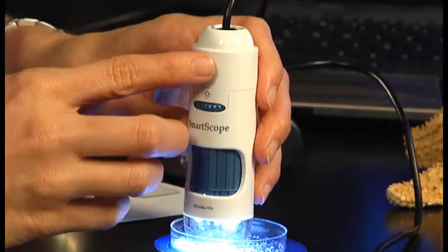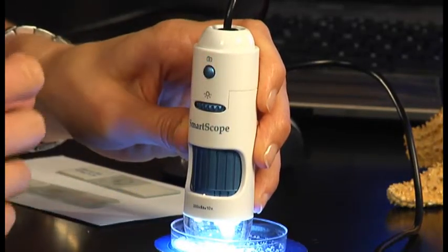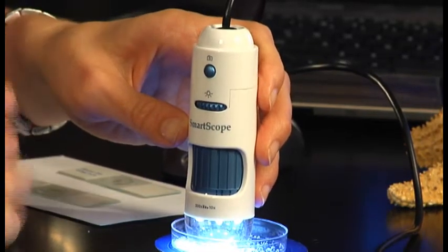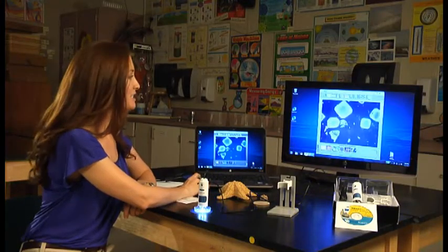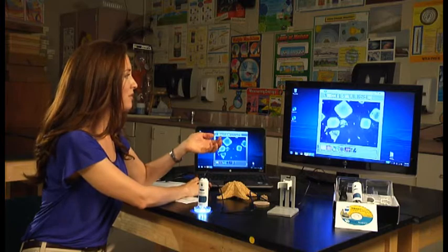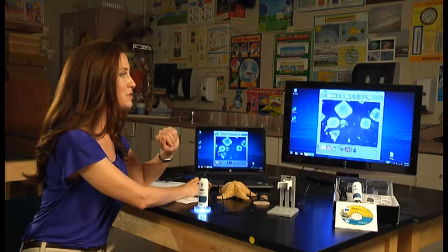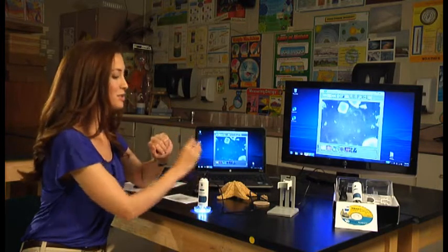I'm actually going to take a picture right now. Remember that first button I showed you at the top? All you do is just click on that. It'll take a picture. And then if you want to view your pictures, double click again to get out. And after you've viewed the photo, all you have to do is click on go back at the top. And it will return you back to your live image.